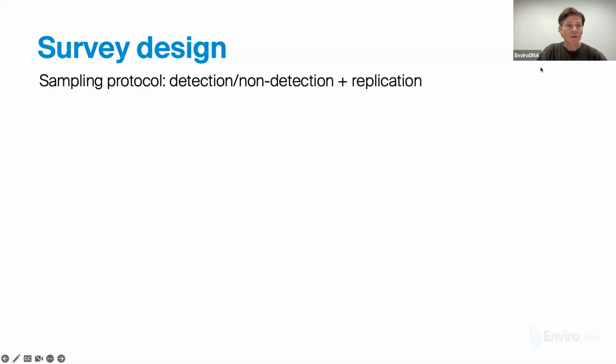So Josh touched on this a bit last time, and so I'm going to move through it pretty quickly, but you will implement a sampling design. You will think about the aims that you are trying to achieve before you collect any data.